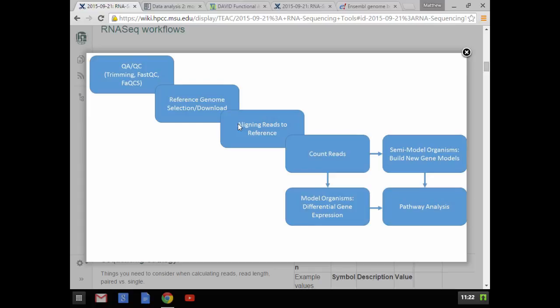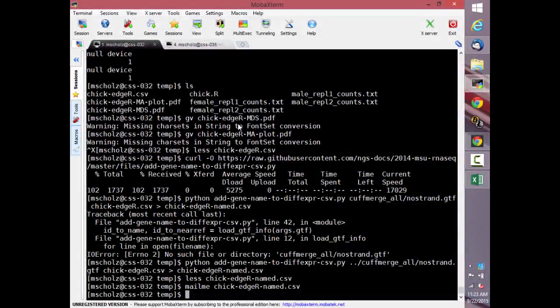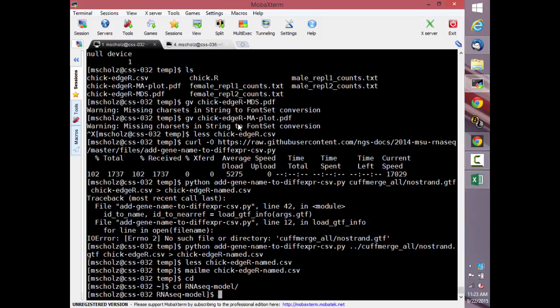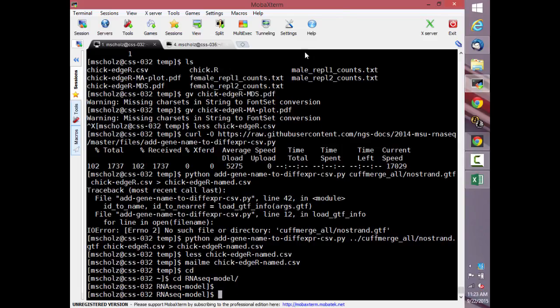Okay, so let's take a look then at option B. So let's look at reads. Is this big enough for everybody to see, other than the fact that the people in the back can't see the bottom? I can make the text bigger. I can't make my screen stretch to the top. It's dumb. So I'm going to just do a lot of clears here.